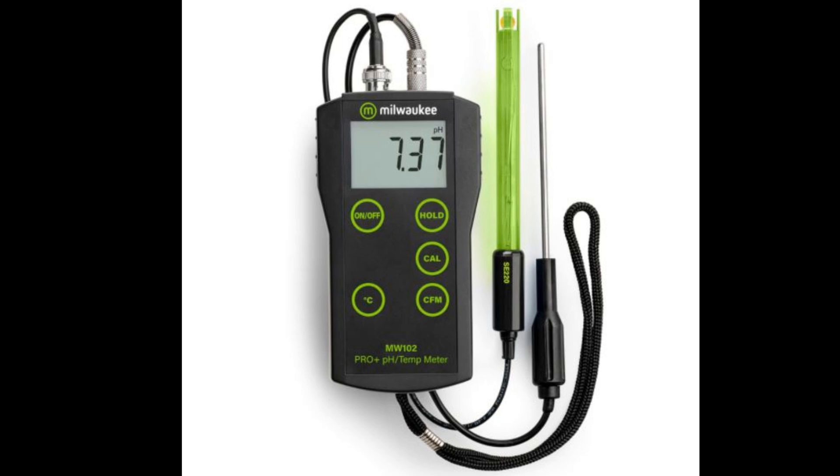They really emphasize this plus or minus 0.02 pH accuracy. It sounds really precise, but what does that mean practically? It's huge, especially when you're talking about brewing. Think about making a delicate IPA — you're trying to get that hoppy bitterness just right. If the pH shifts even a little, like just 0.1, it can throw the whole thing off. It can get way too bitter or lose all the aroma.